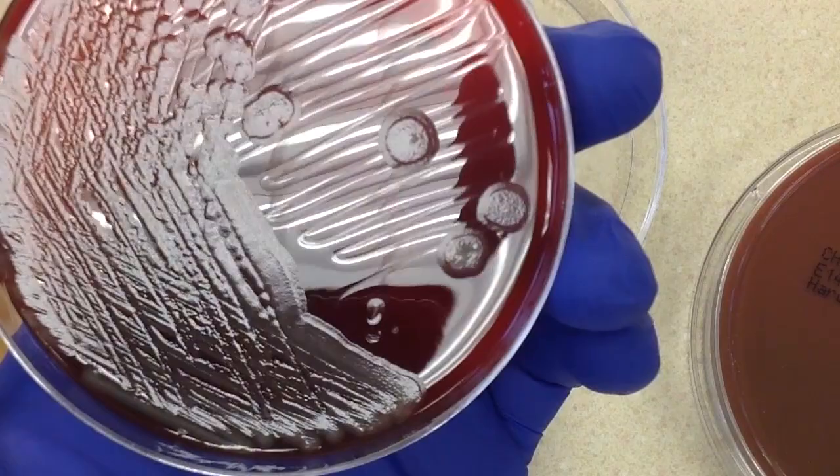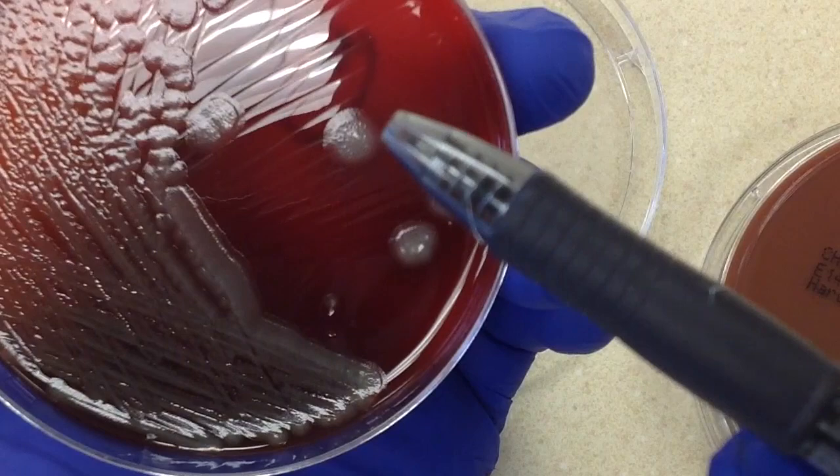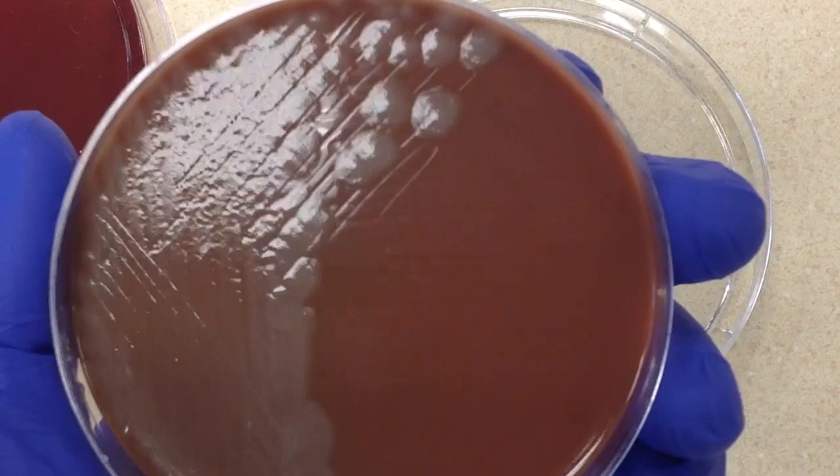It looks like just one colony type — large grayish colonies. You can see they have kind of two zones: an inner zone and then an outer zone. I don't see any hemolysis on these. The chocolate plate looks very similar to what we have on the sheep blood plate.